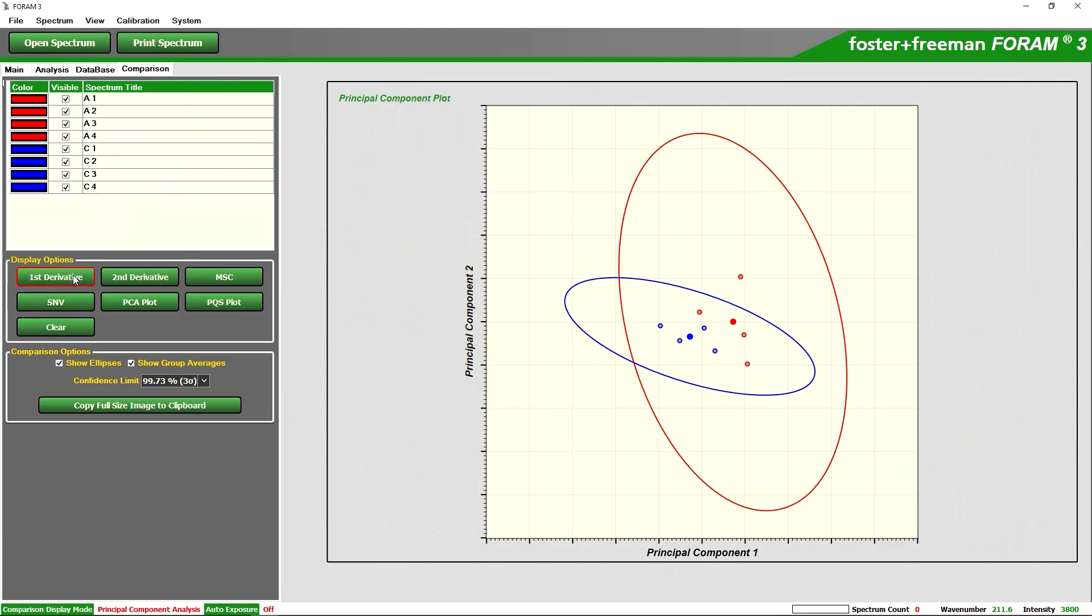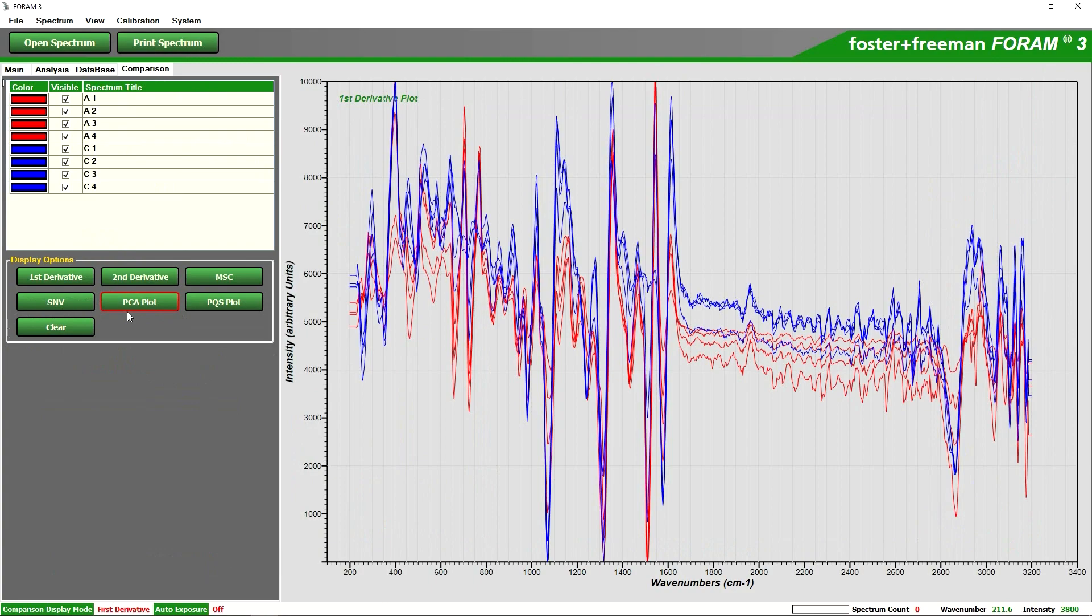For example we'll start with the first derivative. Here we are examining the specific gradients of the graph themselves and again we can analyze these in a lot more detail but we can see that they are behaving very similar.